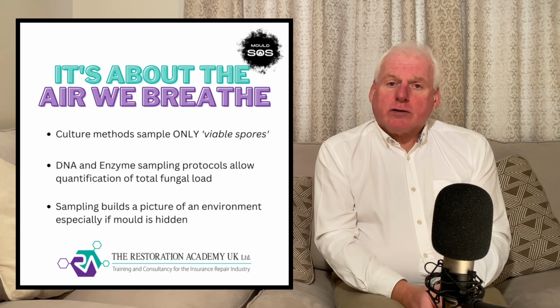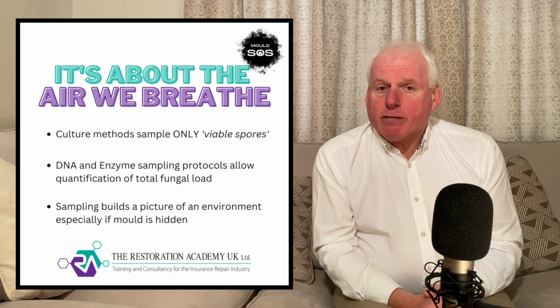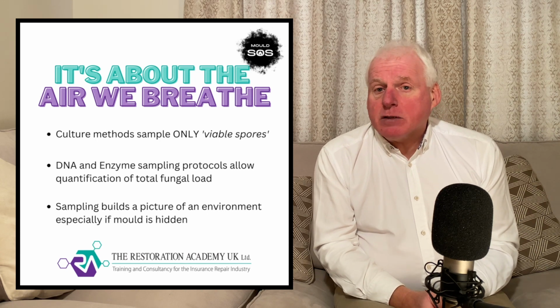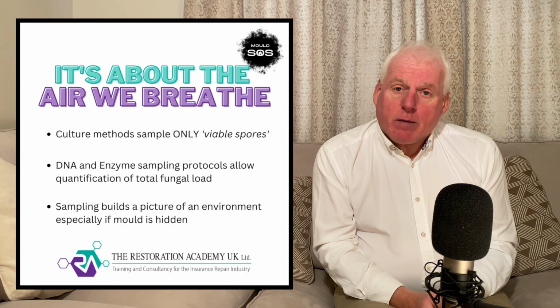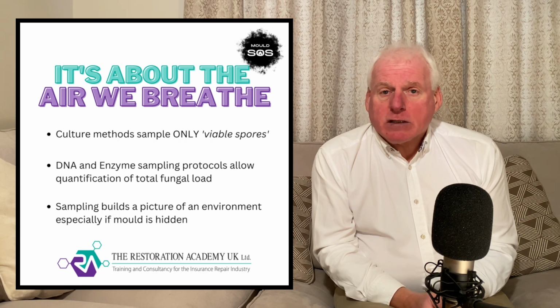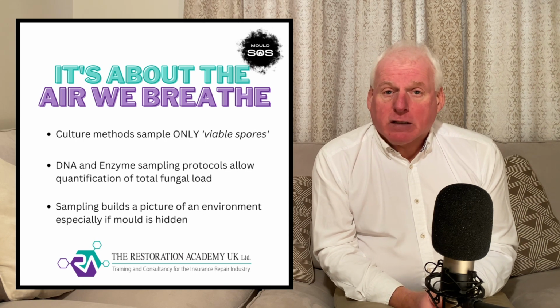However, if you have watched the videos from our mould playlist, you may recall that all the fungal debris from a mould colony has the potential for harm to humans, including the non-viable spores as well as hyphal fragments, enzymes, ergosterols and mycotoxins. So air sampling methods that enable us to measure the total fungal load in the air may be the most useful. Air sampling methods can be an effective way of building a picture of the levels of mould contamination in a building, especially if mould growth is suspected but not visible.